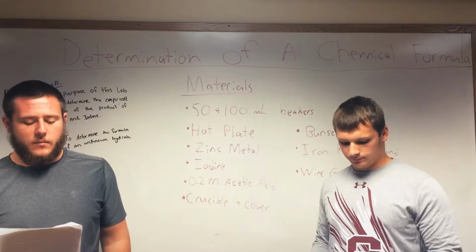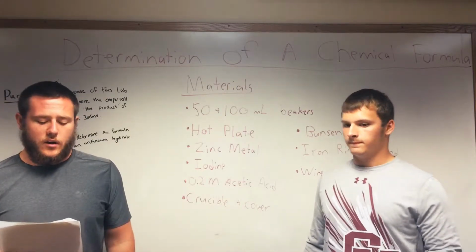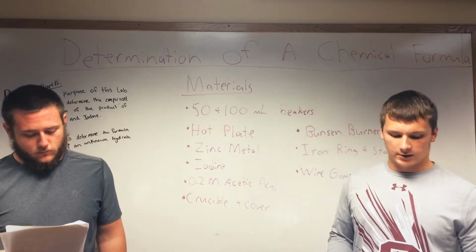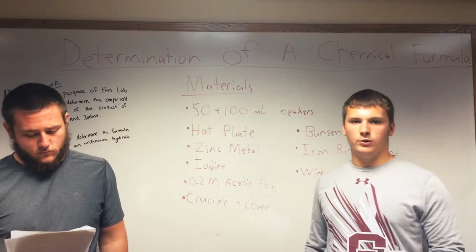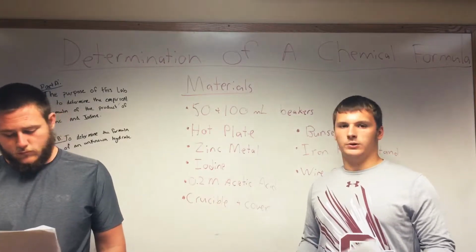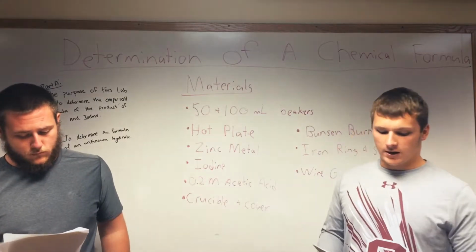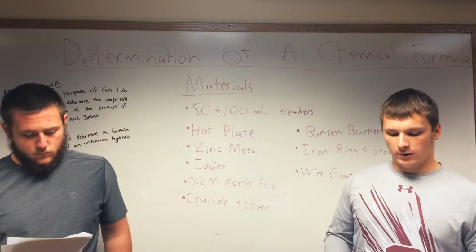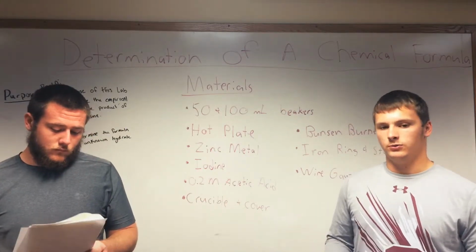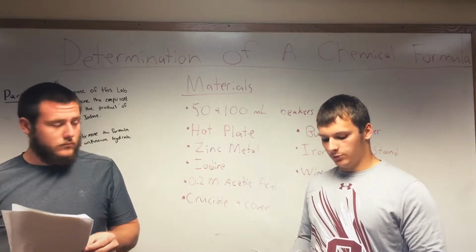Then we turned the heat up for 5 more minutes. Then we let it cool down and waited again and recorded its mass then. After we heated it the second time, if the mass was within 0.1 gram of the first mass that we took, then we were done with that substance. If it was not within 0.1 gram of the first mass, we had to heat it again until it was within 0.1. So it could have been another 1 time of heating, another 2 times, it just depends.